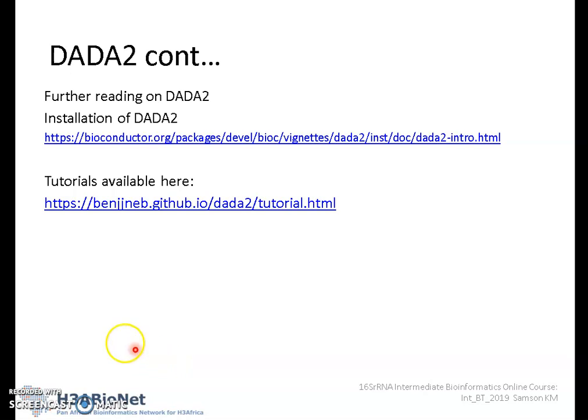DADA2, if you want to install it, you can find it in this link. But also there are some good tutorials in this link, so you'll be able to get all this information about the DADA2 pipeline, which is also one of the great pipelines available.